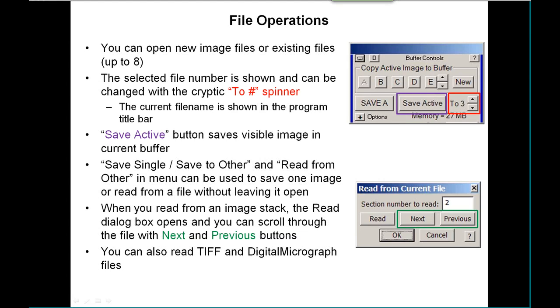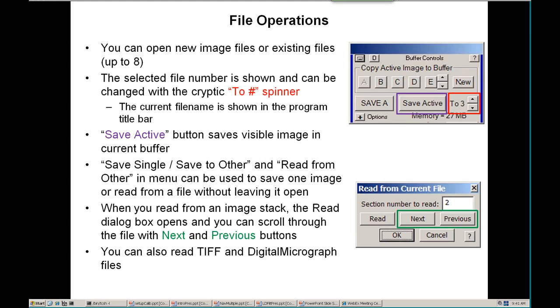Now let's look at what we can do with files. Obviously we can save images in files, and typically we have open files — we can open new image files or reopen existing files. The program can have up to eight files open at a time, and you can select or see which number file is open with the number spinner in the interface. Every time you switch from one file to another, you'll see the current file name shown in the program title bar change.